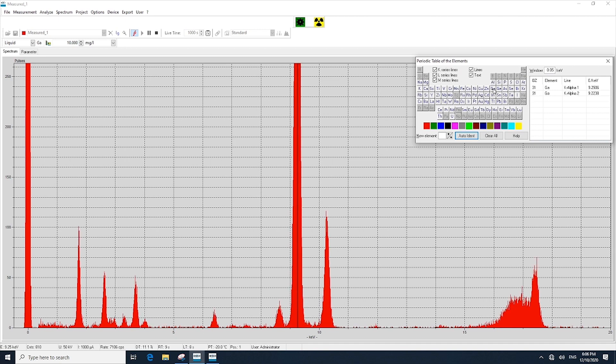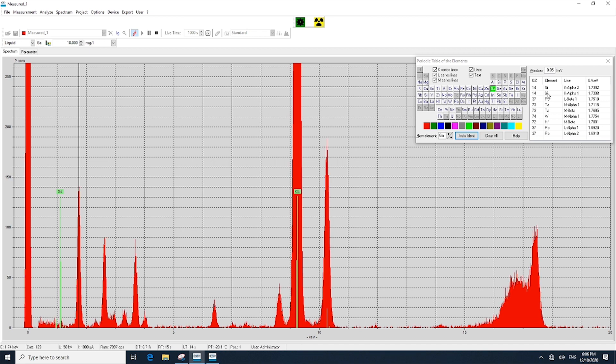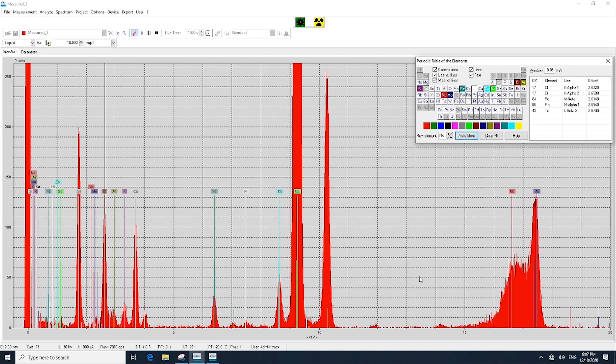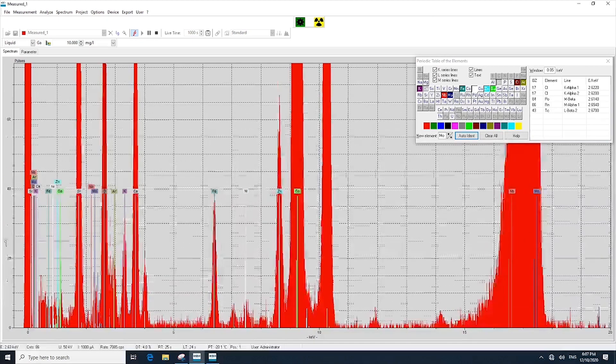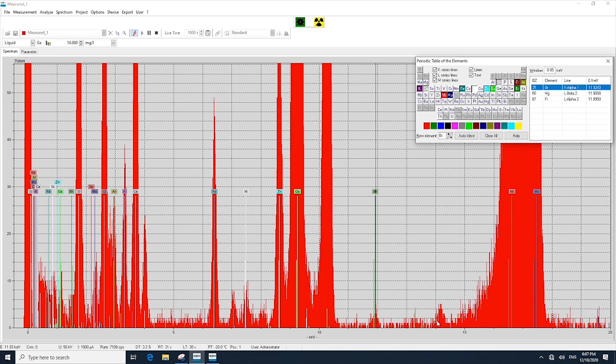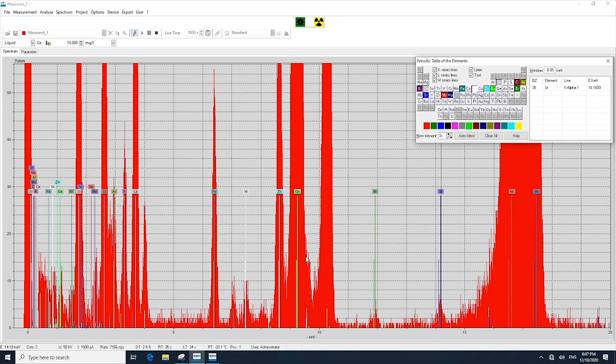We can go through and select these different peaks, which are representative of the particular element in that sample. We can also use auto-identify, rather than clicking on each peak, which will populate those major elements in the sample, and then fine-tune it by also selecting elements that may be at very trace levels. For example, here we see bromine and strontium.